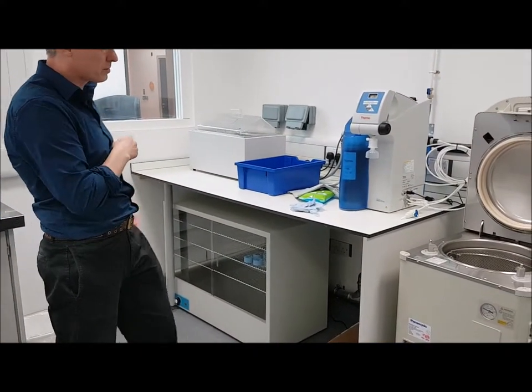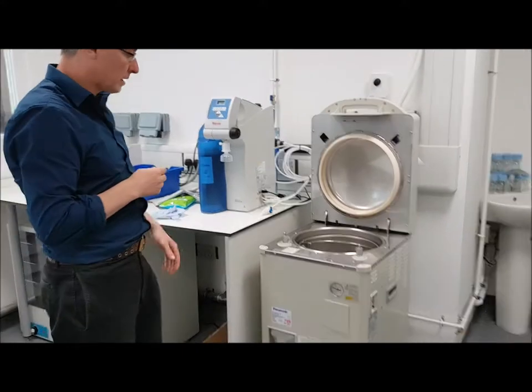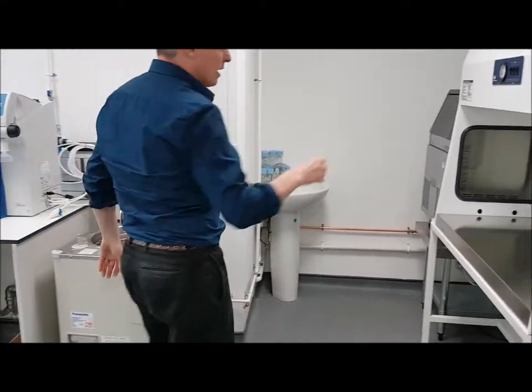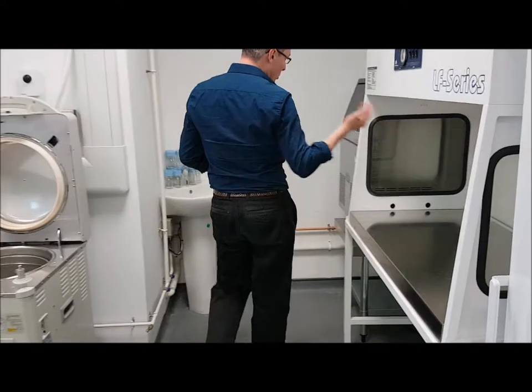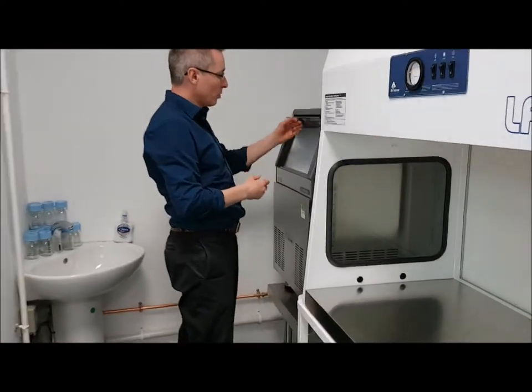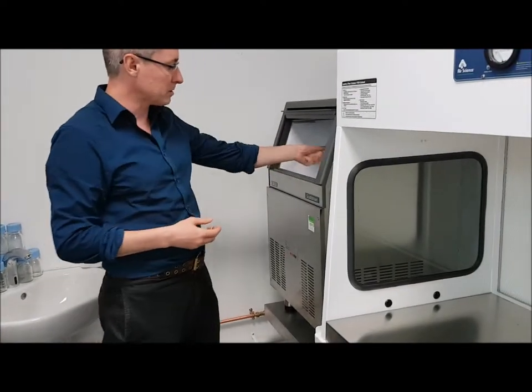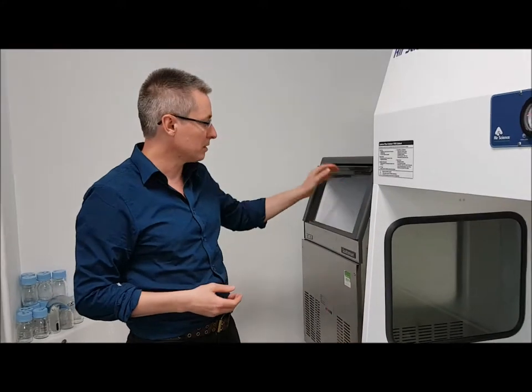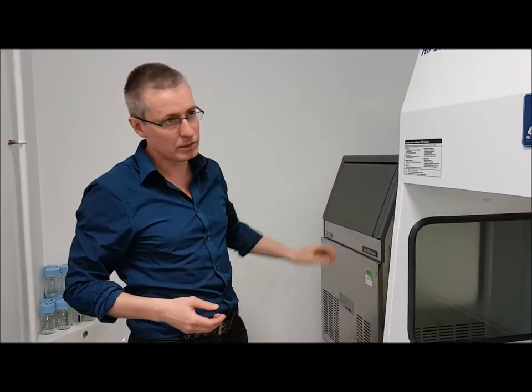water baths, reverse osmosis water, steam sterilization, laminar flow hoods, most importantly for keeping the beers and stuff cold, we've also got the ice as well. So there's an awful lot of infrastructure in these labs, and therefore it's easy to deliver against the programs of our customers and clients.